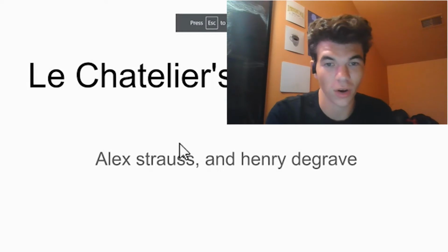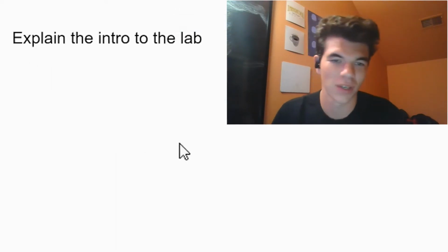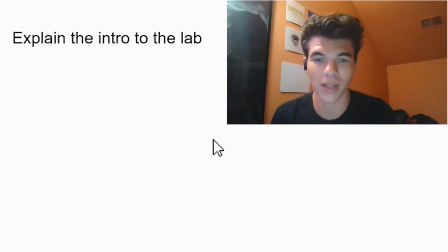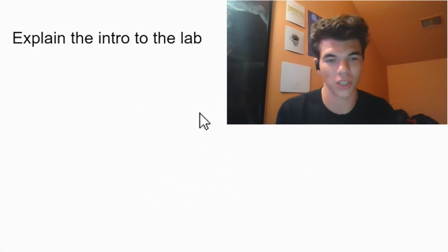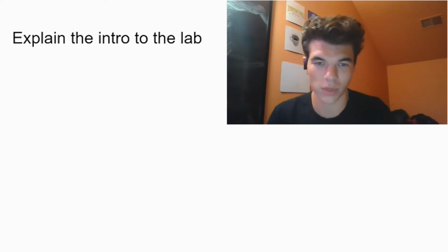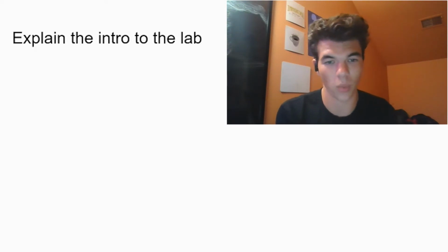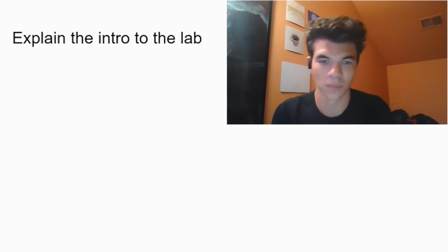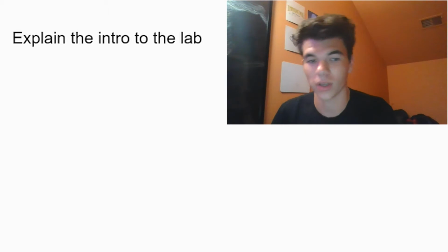Before we get started on the lab, I have to explain something. This lab utilizes Le Chatelier's principle. Le Chatelier's principle can be used to predict the changes to a system due to changes in pressure, temperature, or concentration. In this lab, we're using concentrations to shift the reaction from the reactants, a copper and water complex, to the products, a copper, water, and ammonia complex, and back and forth again, changing the ligands from water into other things.